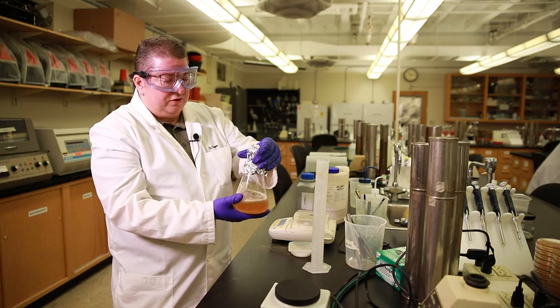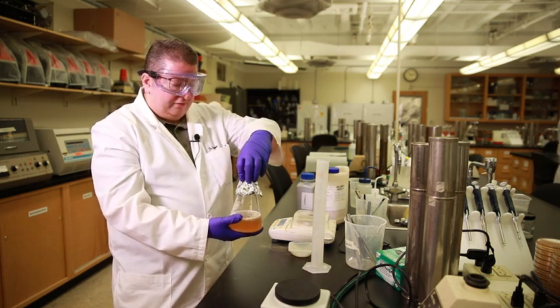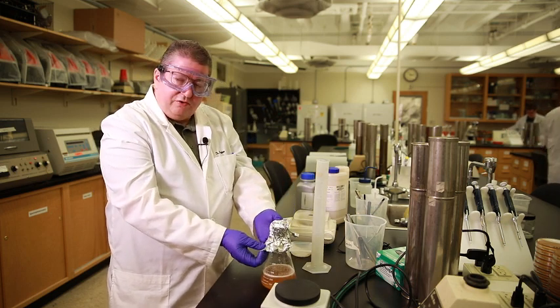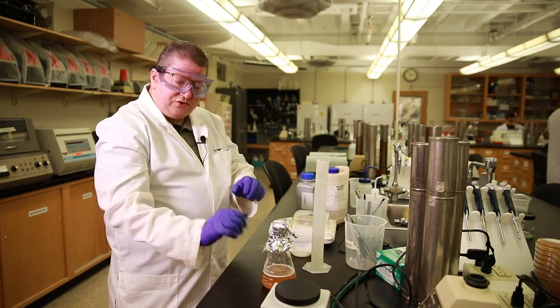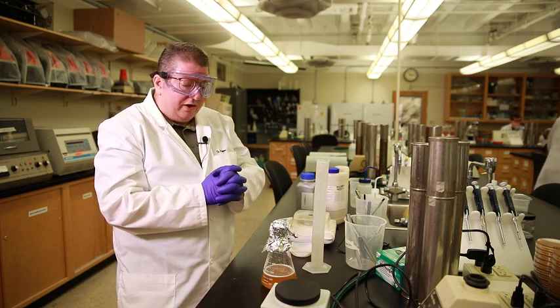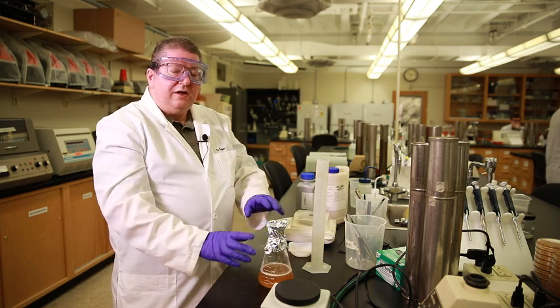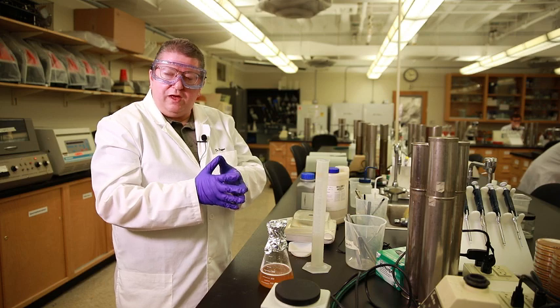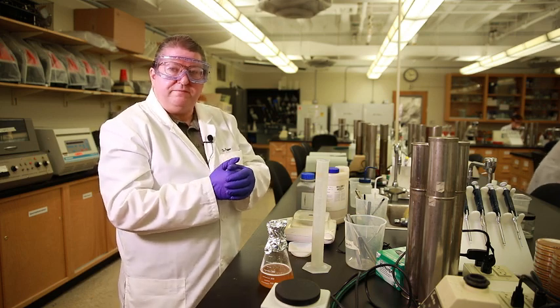What happens here is when we take this out, we won't have any airborne contaminants that can get inside of our flask. When the flask comes out of the autoclave, we'll just peel the foil back and that stir bar will drop down right in there. We put it on the stir plate and let it stir, and everything will evenly distribute before we pour it into sterile petri dishes. In the autoclave, we just put a little piece of tape on this. It will autoclave for about 1 hour, and then it'll be ready to cool in a water bath and then pour it into petri dishes.